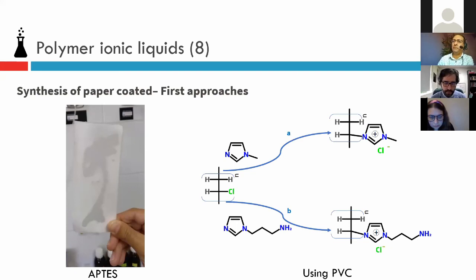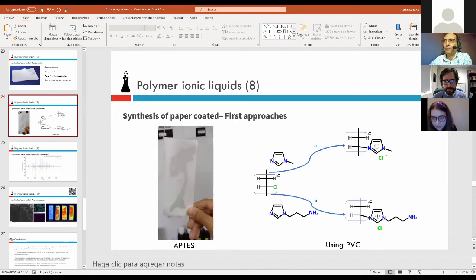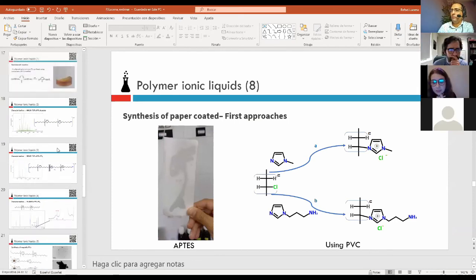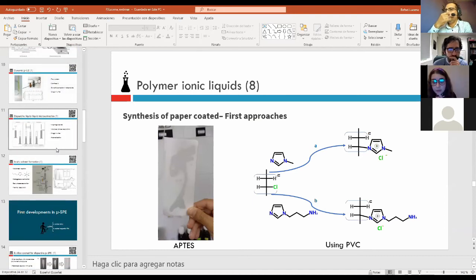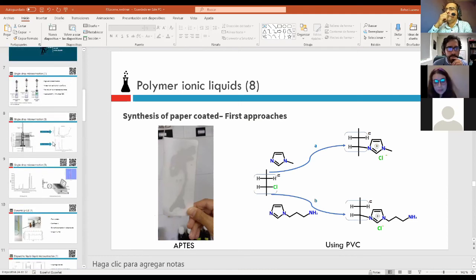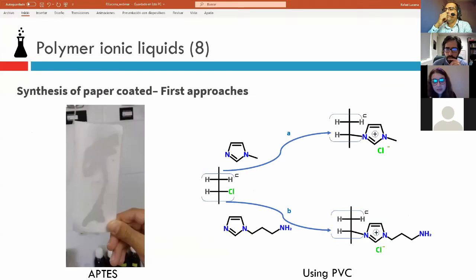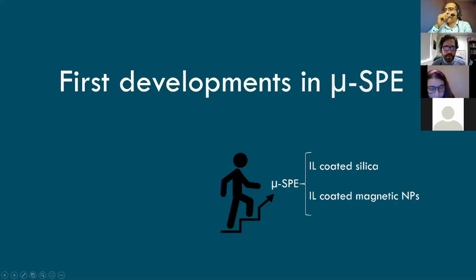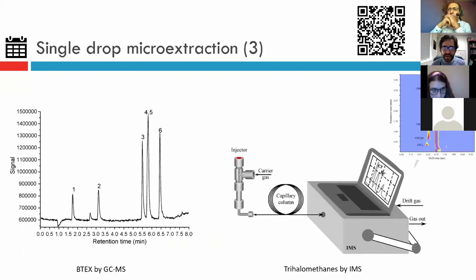Okay, thank you very much. I have a question on the chat. It says two, actually. First, how do you inject the ionic liquids in the analytical equipment that you show? And the second one, on your technique for dispersive LPME, what can you tell us about the kinetics? So the first one is about how do you inject the ionic liquids in the analytical equipment? Yes, I'm going to go. This is the device.